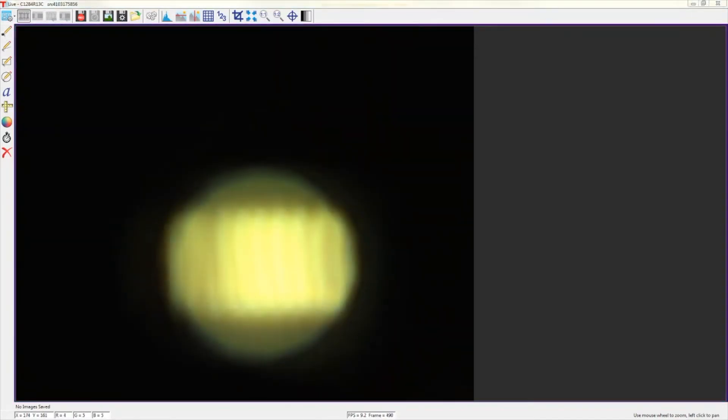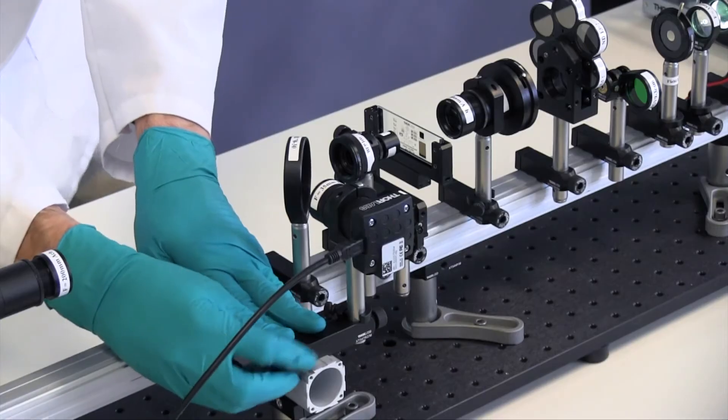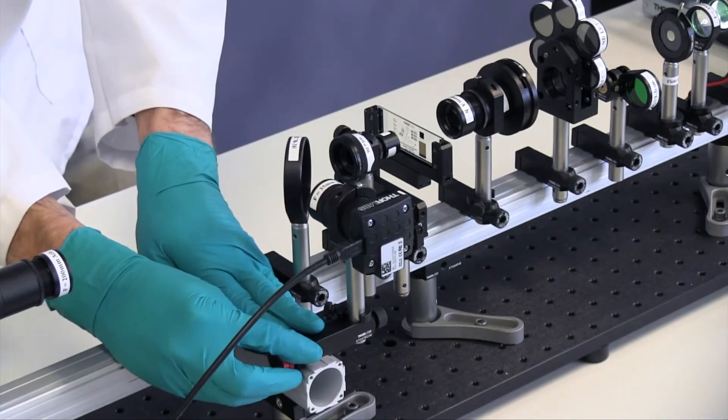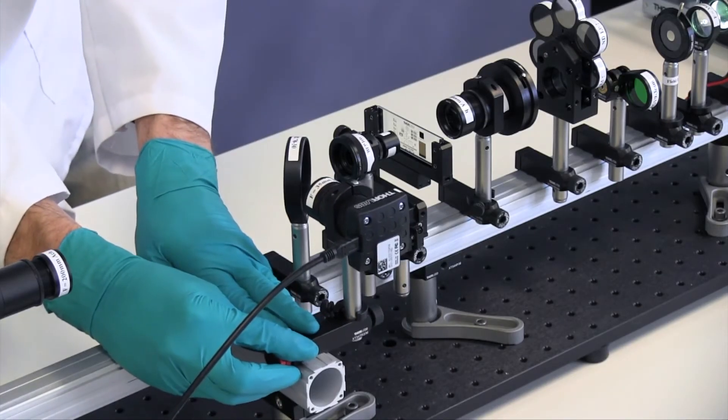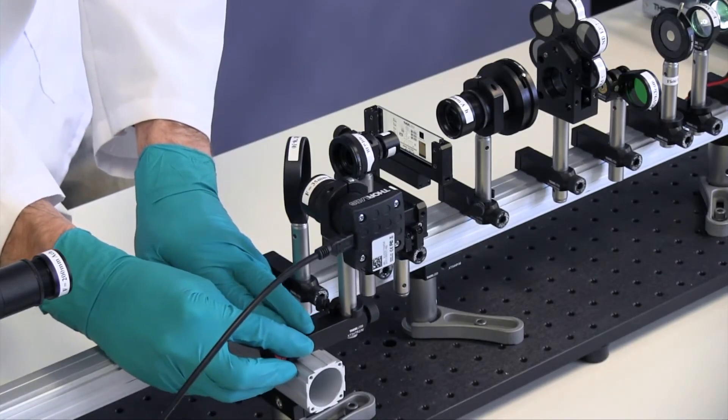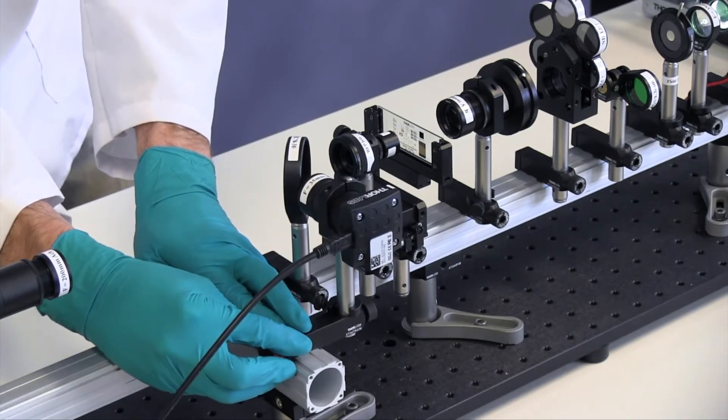Turn the exposure down to reduce saturation. This helps to see whether the aperture iris is in focus. Move the color camera back and forth until the edges of the aperture iris are sharp.